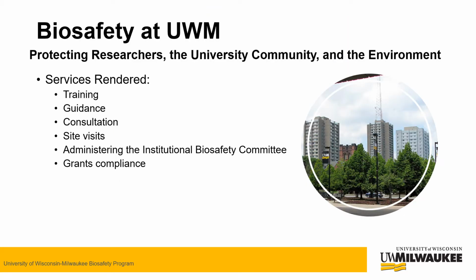The University of Wisconsin-Milwaukee Department of University Safety and Assurance's Biosafety Program oversees the responsible use of biological hazards in microbiology, tissue culture, recombinant DNA, molecular biology, synthetic biology, and biotechnology at all the UWM facilities. The Biosafety Officer, or BSO, and the Institutional Biosafety Committee, or IBC, evaluate and approve protocols for research experiments and teaching experiments that work with biological hazards.